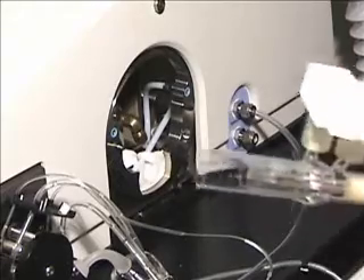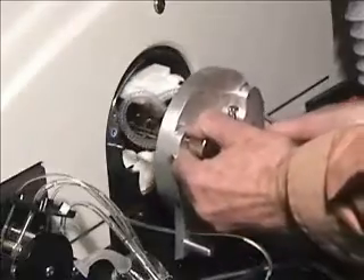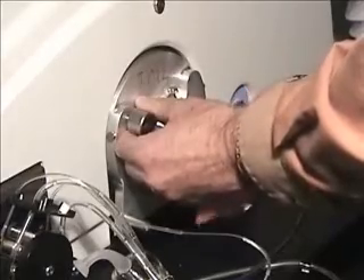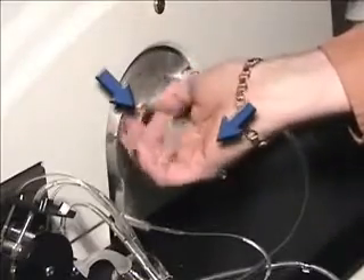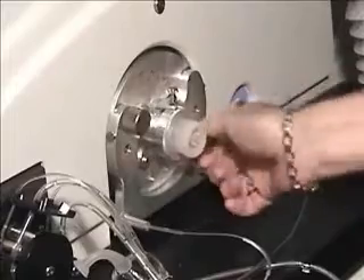The torch assembly is now ready to be installed. Carefully reinstall the torch mount assembly into the torch box. Turn the two thumbscrews clockwise until they are tight, then turn them two more full revolutions clockwise until they click twice.